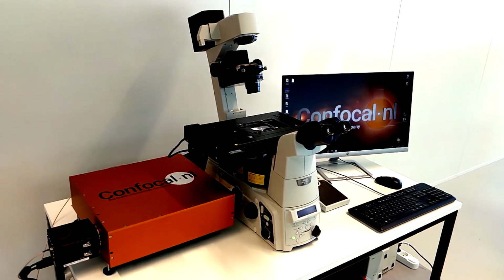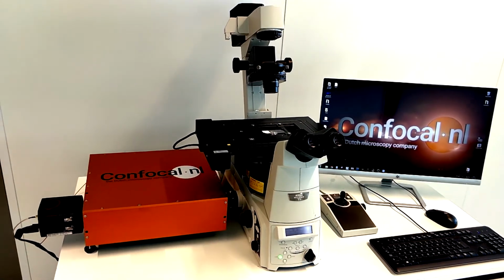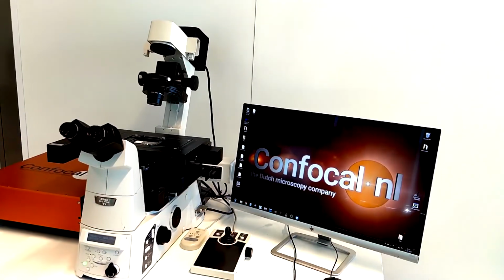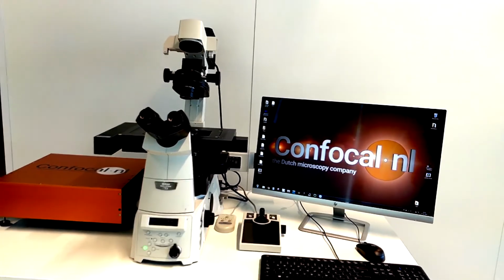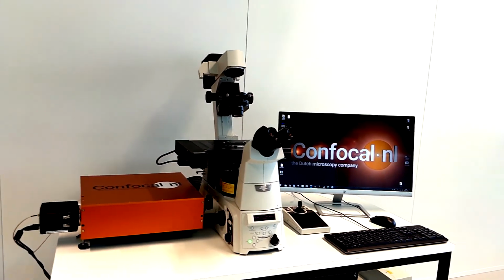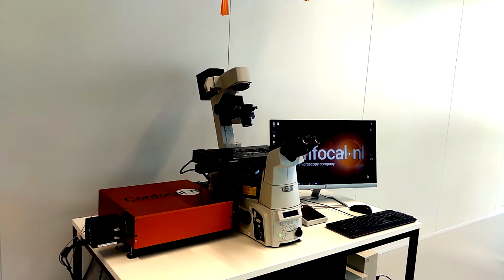Welcome to the tutorial on using the Rescan Confocal Microscope, or RCM unit, with the open source platform for microscopy imaging, Micromanager. Micromanager supports multiple platforms, Windows, Mac and Linux, and provides an open plugin interface for adding new devices. Combined with ImageJ, Micromanager provides a full-featured microscope management and image processing package comparable in capabilities to commercial solutions. It is distributed free of charge and under an open-source license.